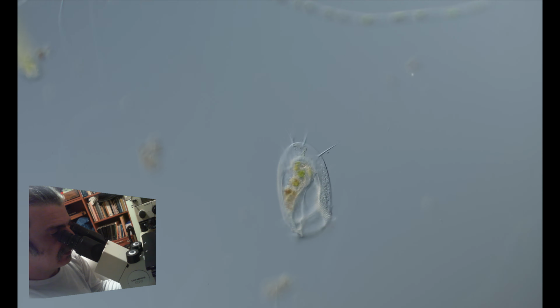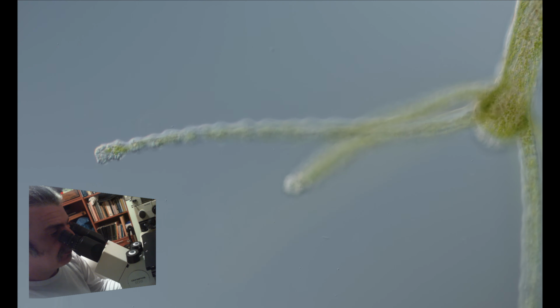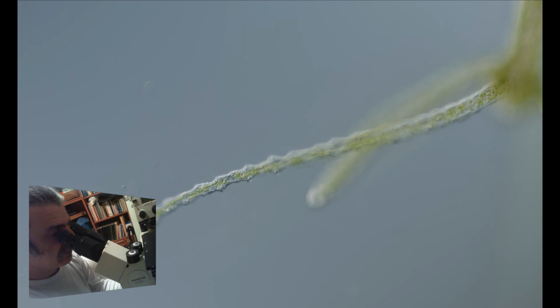And here is Euplotes, another very common ciliate. It's very fast, but we can track it. Right now I'm in the middle of the water column. The water column is about 0.5 millimeter.